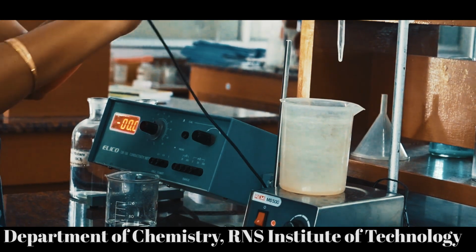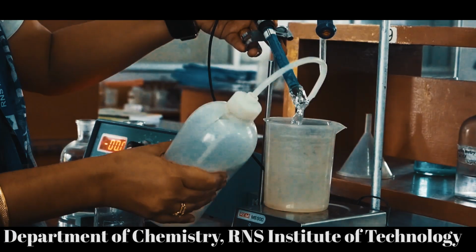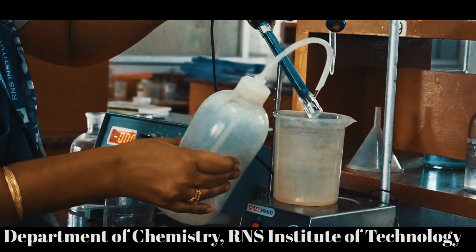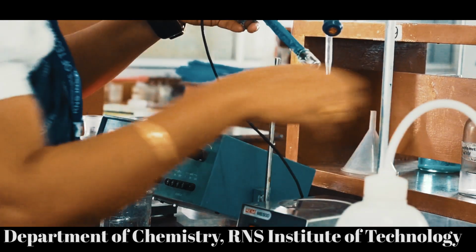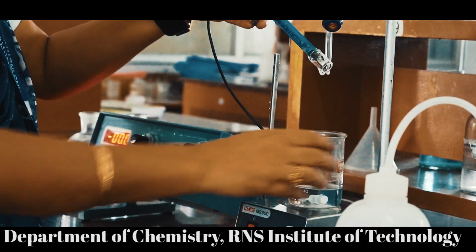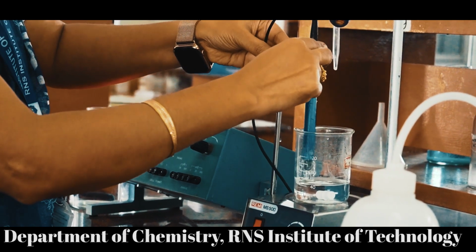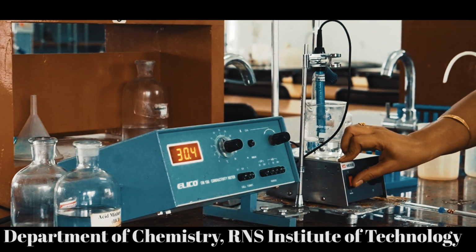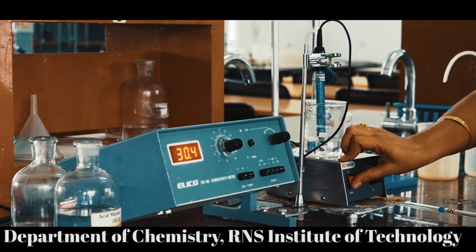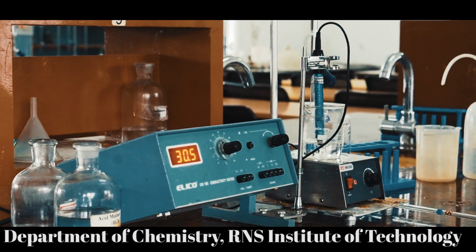Before using the conductivity cell, we should wash it thoroughly with demineralized water. Wash the platinum electrodes as well, then keep it aside. Then we should take the sample and dip the conductivity cell into it. You are using the magnetic stirrer for the mixing of the solution. So switch it on, it will help us to mix the sample.